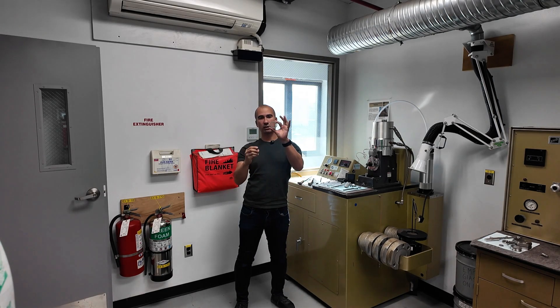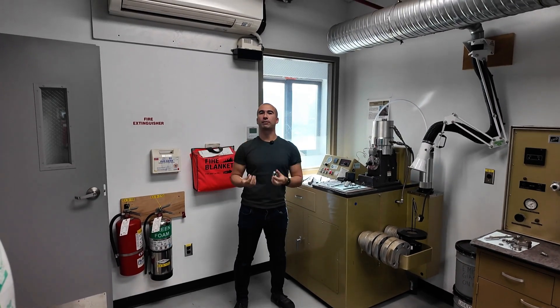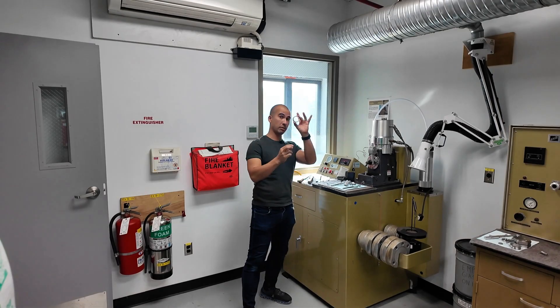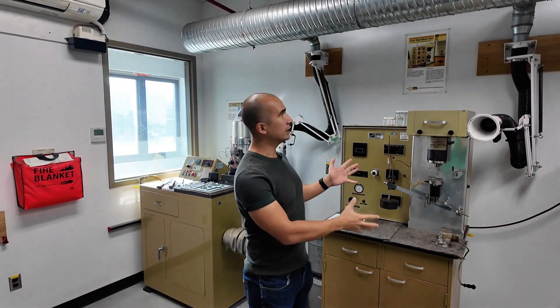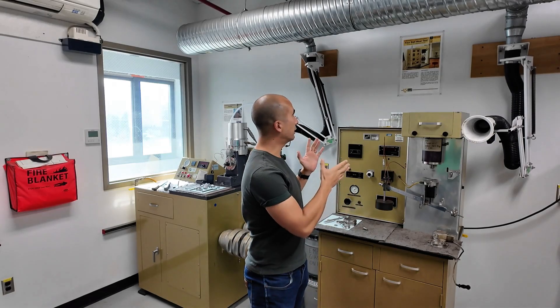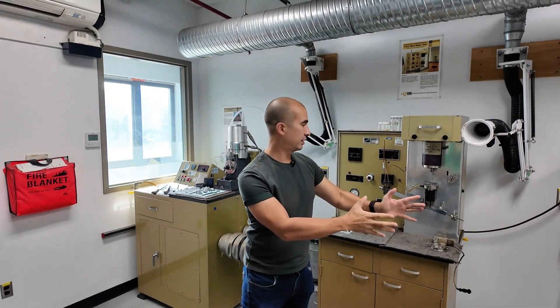So in this instance, we've got a rotating disc against a block, and that's going to give us a very specific kind of lubrication condition. As we move across, what we've got here is the four ball tests. You're probably familiar with the idea that there is a four ball wear test and then a four ball weld test.